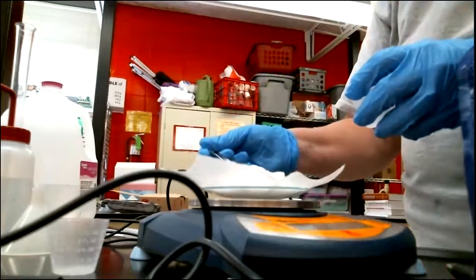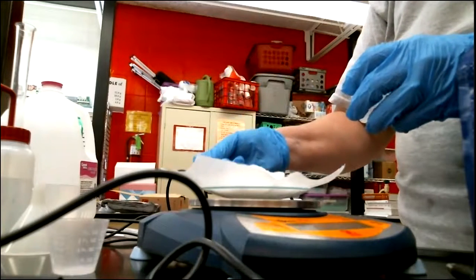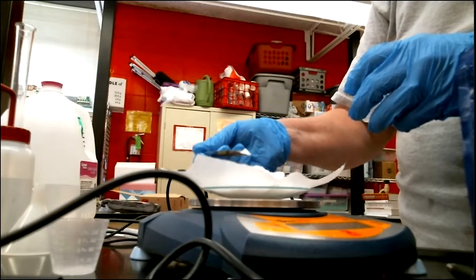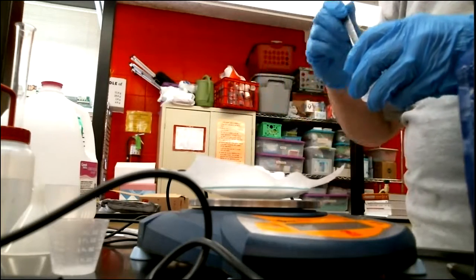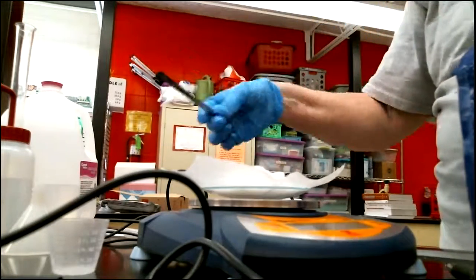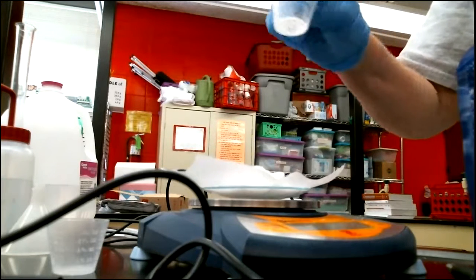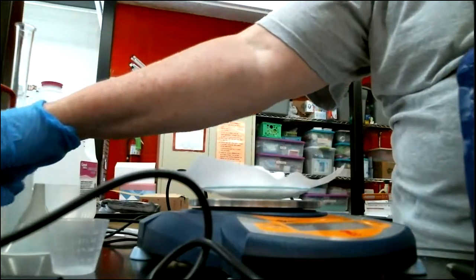I'm going to take just a scoop out with my spatula, put it back in my little cup till I get my amount. 60.16. That's good enough for me. Now, good lab practice is after I've taken stuff out of the main container, I don't put it back in the main container because I might contaminate it. So I'm going to set that off to the side.